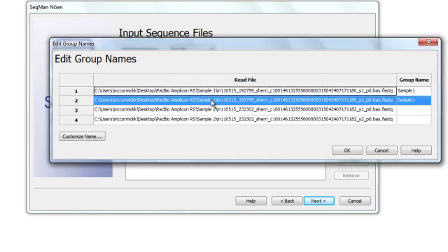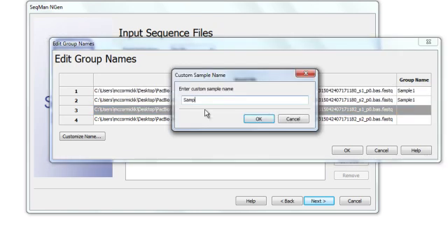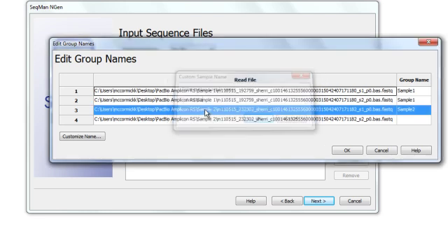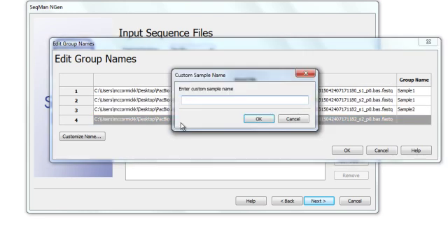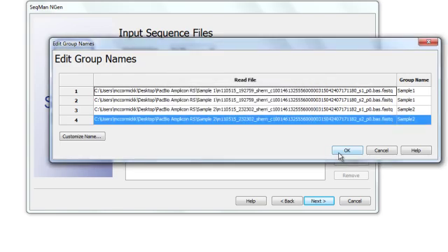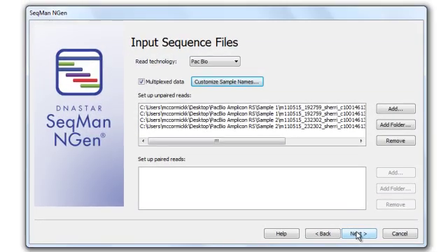I do this for each file, and then click OK. And now that my samples are set up, I click Next.